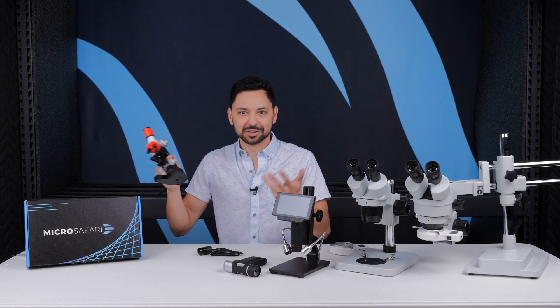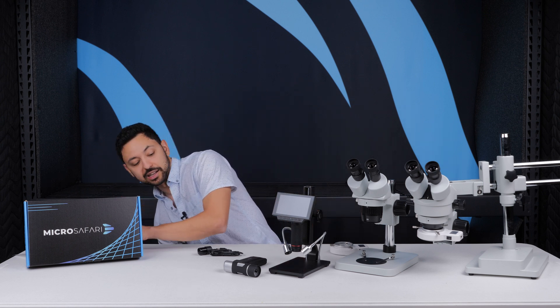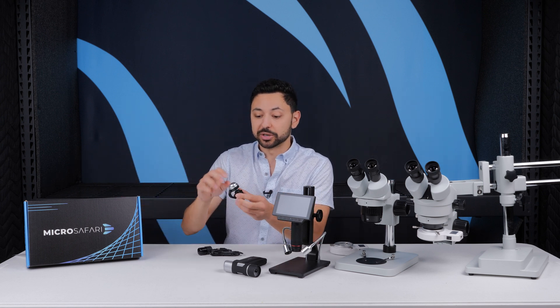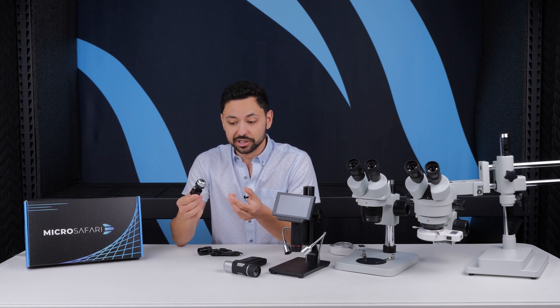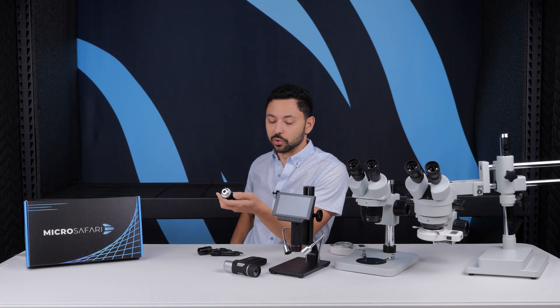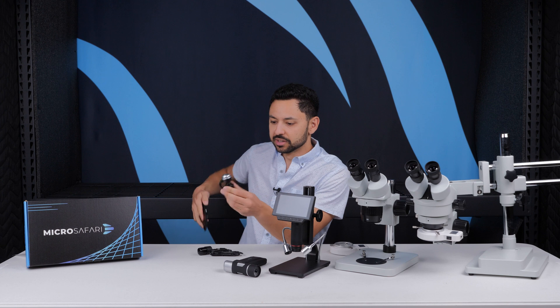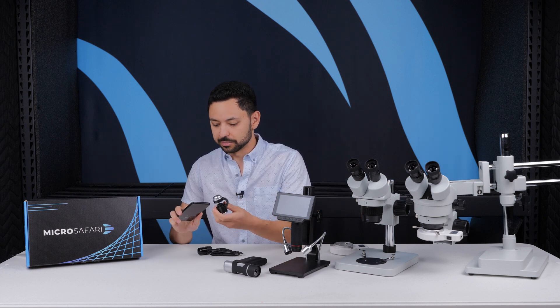I think you're going to have a better time getting a good magnifying glass at that point. But you can definitely do better, and that's where the smartphone microscopes come in. I really love these things because they're super versatile and super easy to use—kids can definitely use this. The downside is that you have to use it with a phone or an iPad. This is the one that we carry; we've tested a bunch of smartphone microscopes and this is the one we like the most.